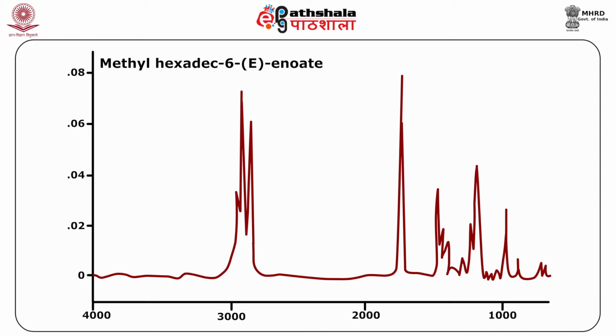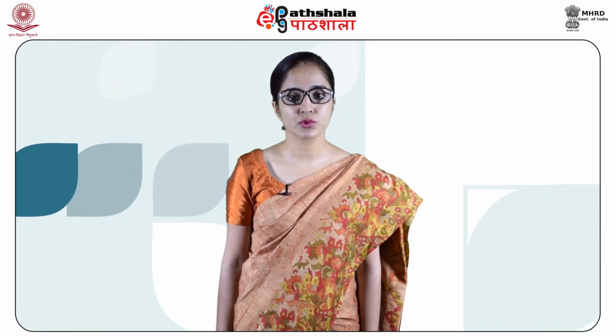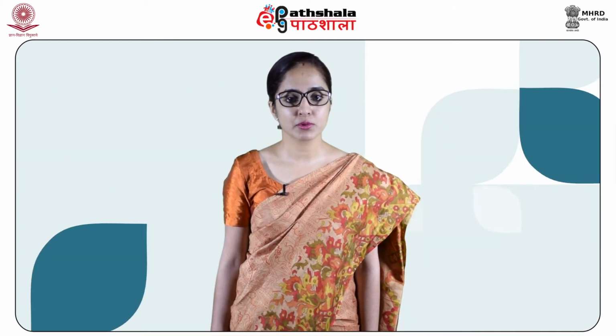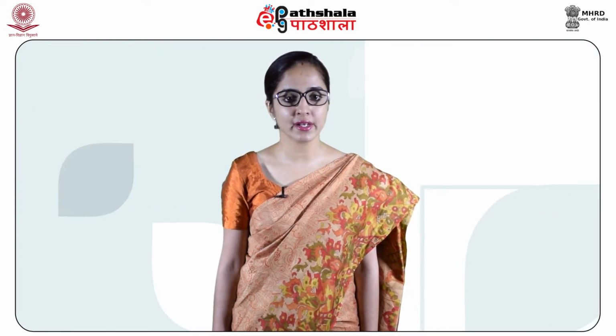Now you can see how IR spectroscopy is helpful in distinguishing between the cis and trans isomers. Similarly, the absorption peak due to C≡C stretching is IR active and is observed in CH3C≡CH, that is propyne, whereas it is absent in the IR spectrum of but-2-yne, the 4 carbon non-terminal alkyne, which is IR inactive.